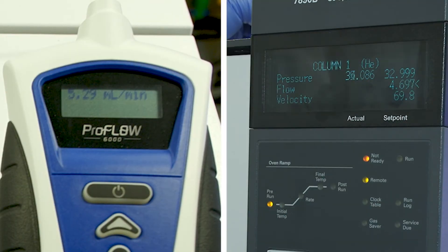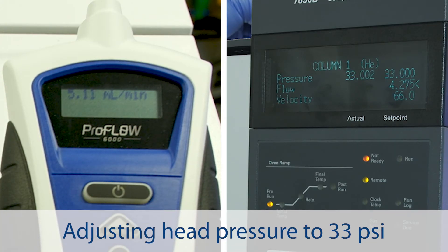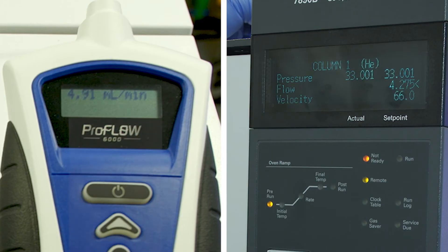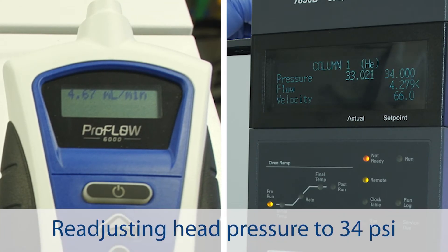Measuring column flow. Starting with the column, a great use for a flow meter is measuring column flow. While this can be an excellent troubleshooting step for all columns, packed and micro-packed columns stand to benefit the most due to pressure drop variations.